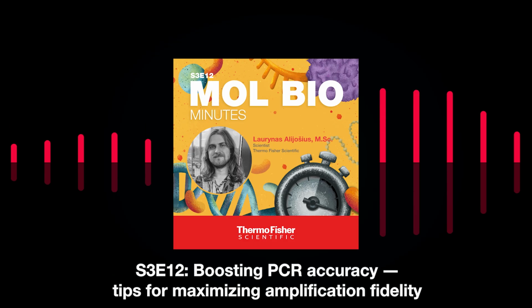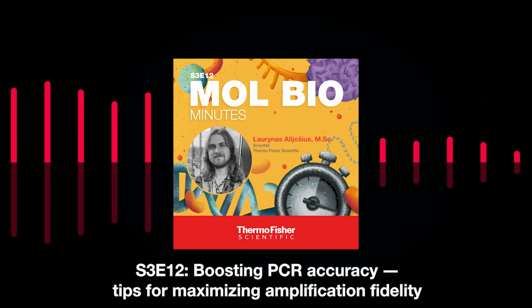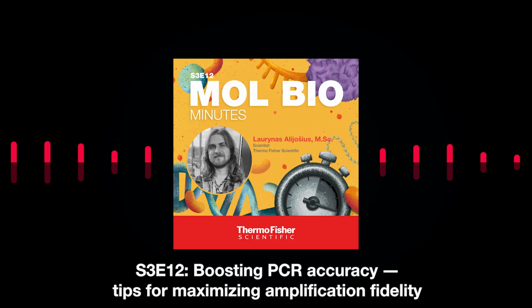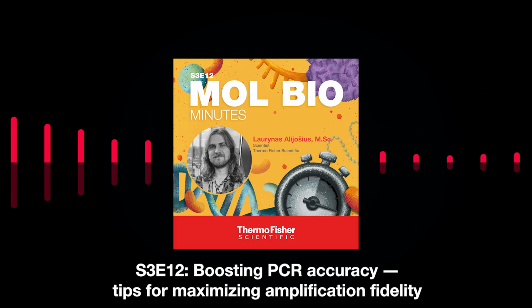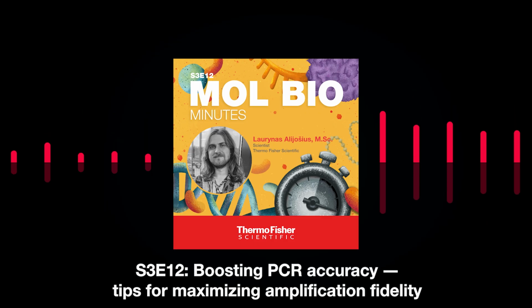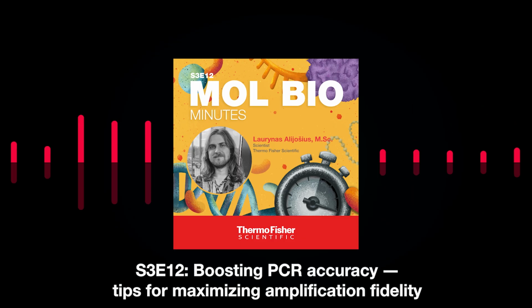And if your PCR is accurate, like I said earlier, your results will be more reliable. So, in that sense, you will need to repeat your experiments fewer times. That means that you will use fewer consumables, you will use fewer reagents. In general, you will use less money.